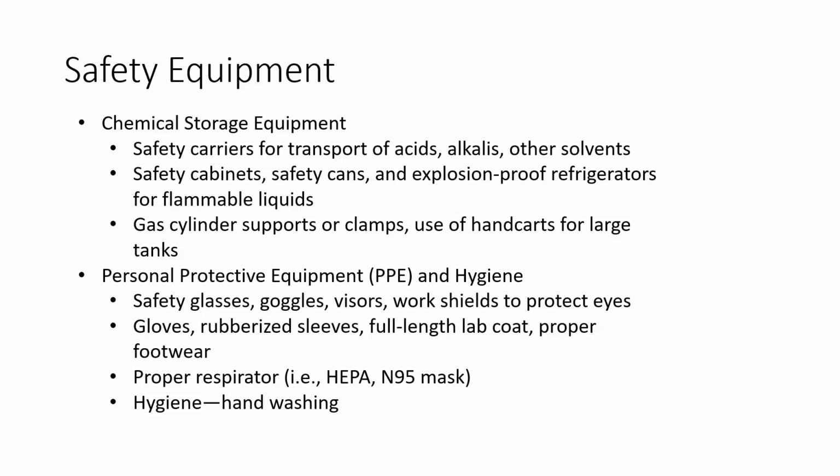Personal protective equipment, PPE, and hygiene. Safety glasses, goggles, visors, work shields to protect eyes, gloves, rubberized sleeves, full-length lab coat, proper footwear, proper respirator, so a HEPA filter respirator or an N95 mask. Hygiene and hand washing is also important.